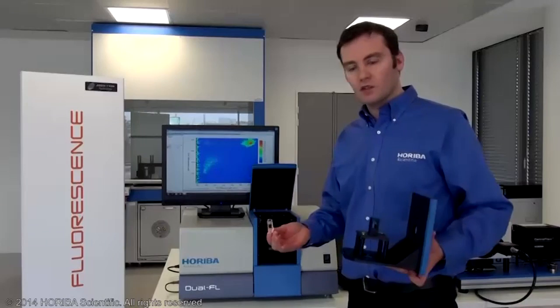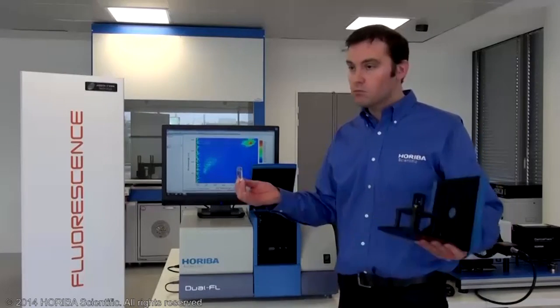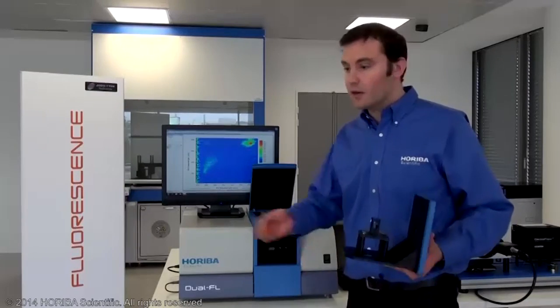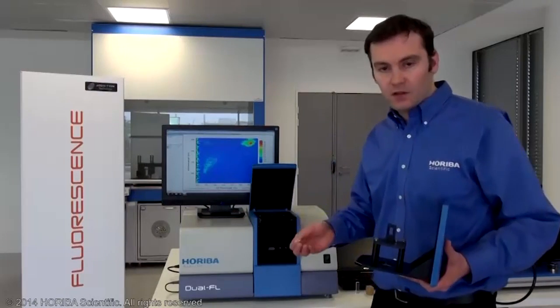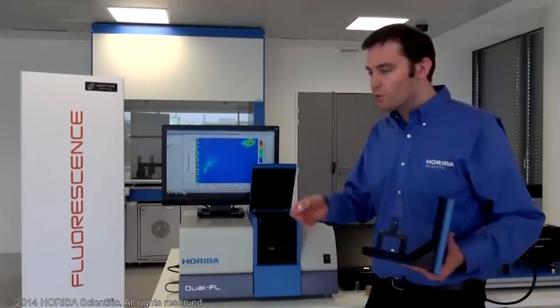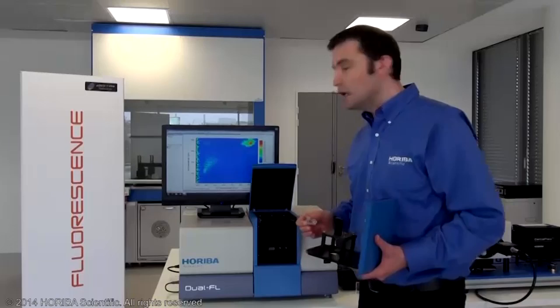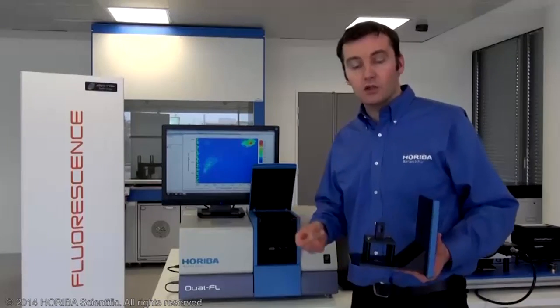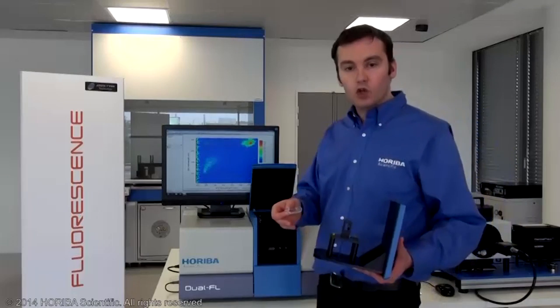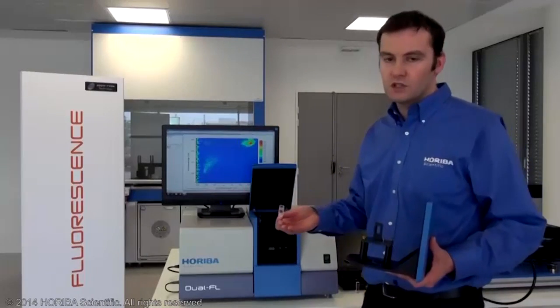When we discuss water analysis, it could be lake water analysis, or rain or tap water. You can detect if there are some compounds inside, some drugs, some fluorescent compounds. Typically also for water treatment, you can check before and after the plants, see if there is any evolution and if you remove the unwanted molecules.